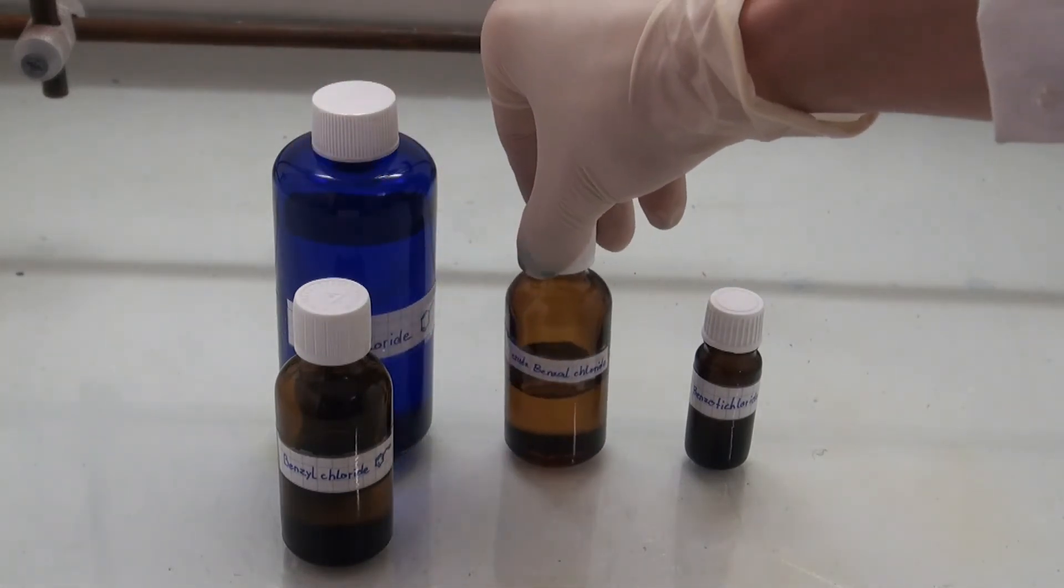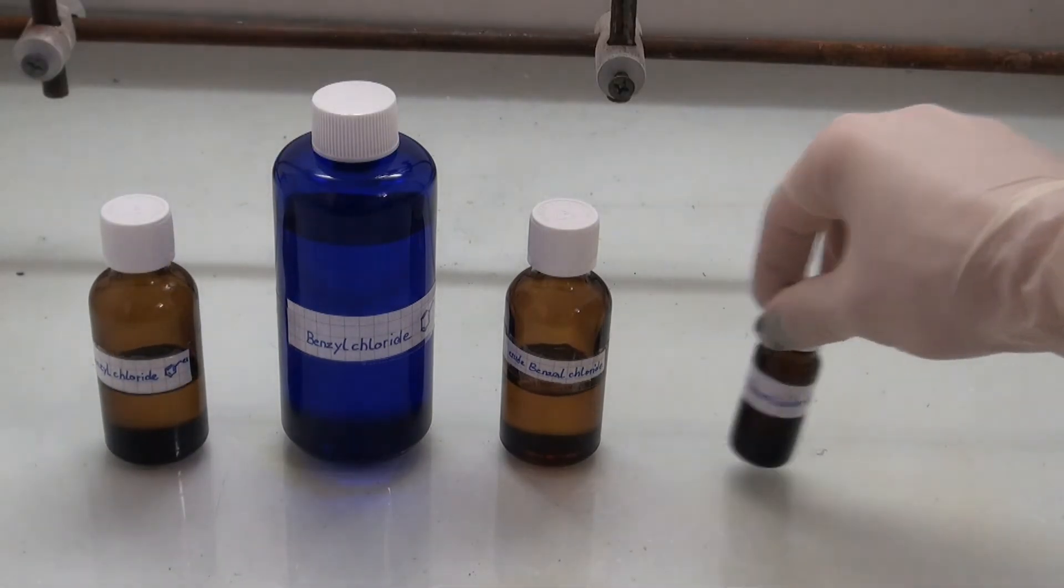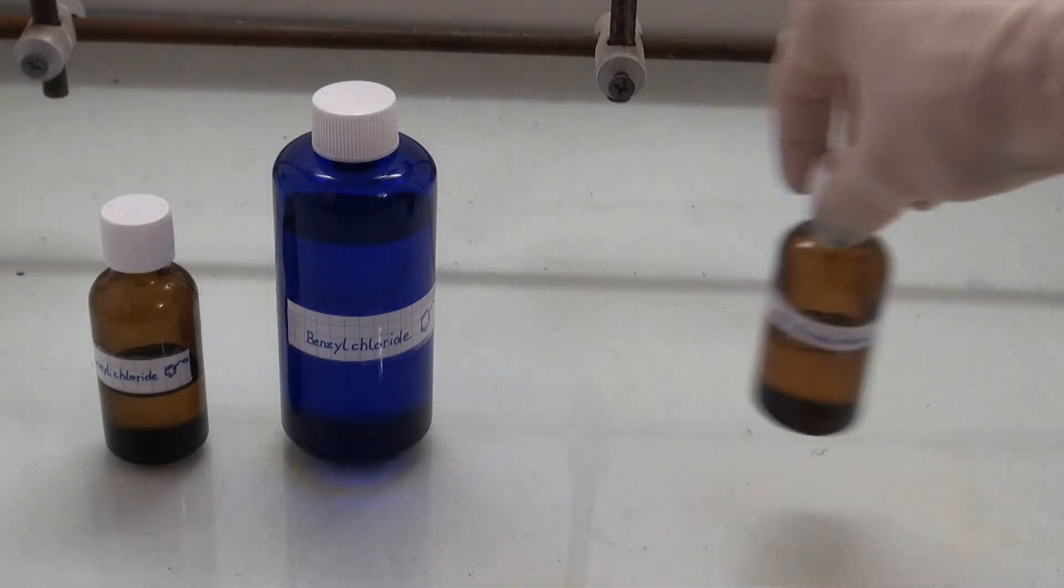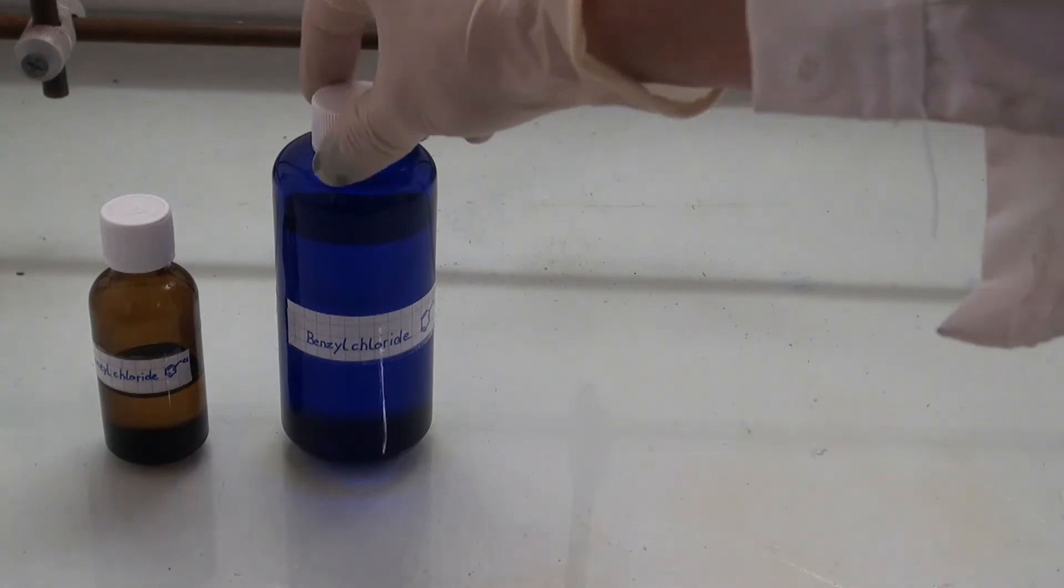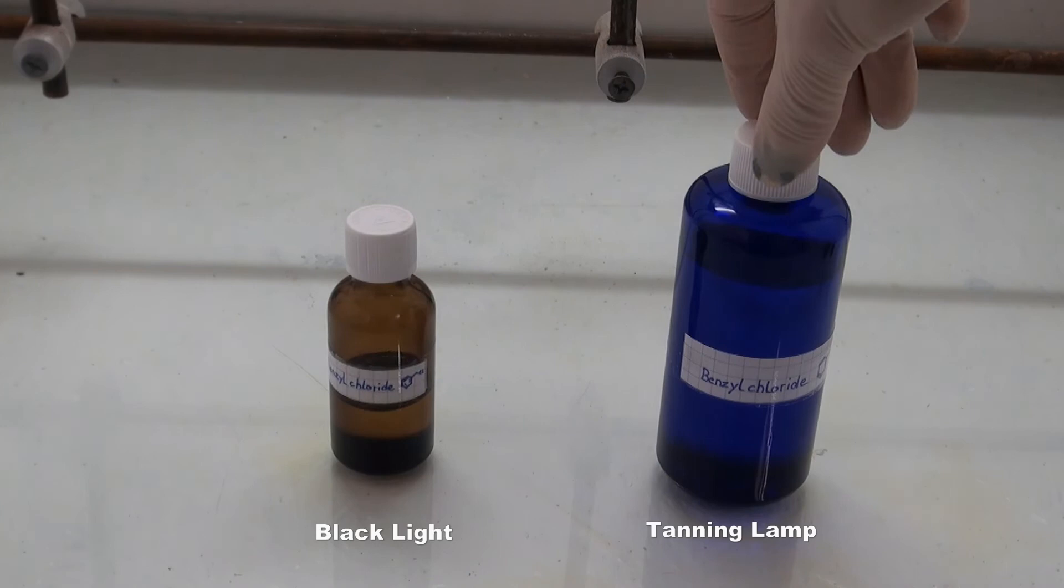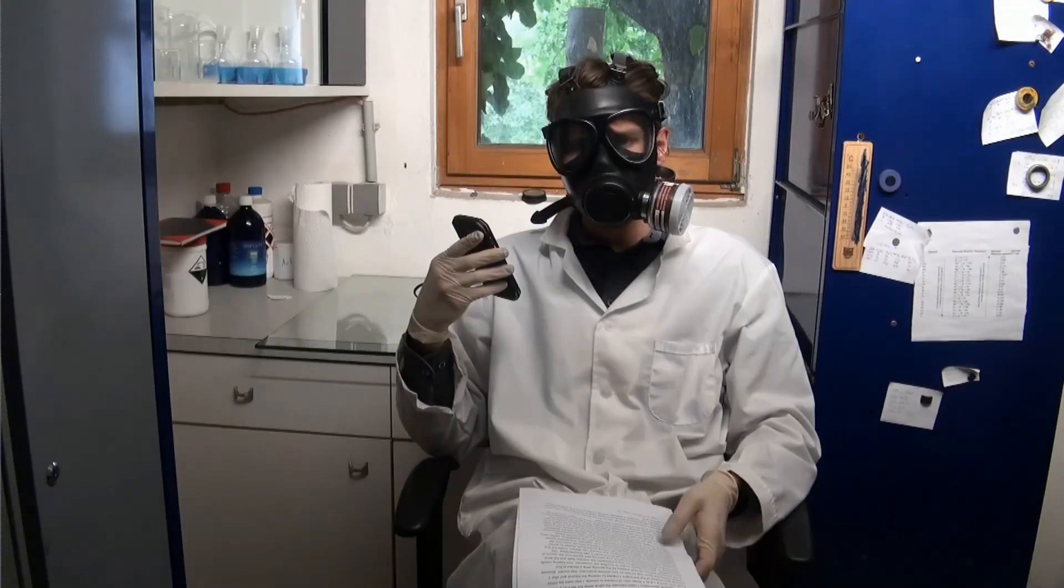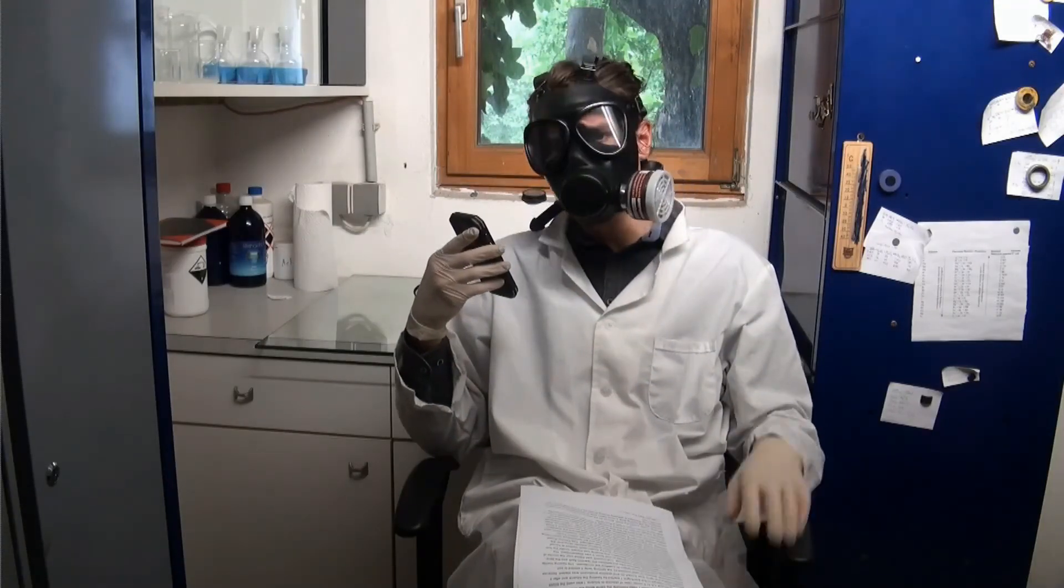Although I used double the molar amount for the second chlorination, I can clearly see that with the tanning lamp, a much higher yield of chlorinated hydrocarbons was obtained. The black light is definitely working as well, but it is a lot weaker than the tanning lamp. I hope you liked my video. Bye.